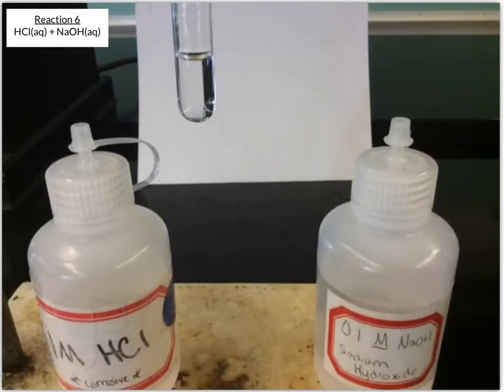But again, we had that happen with another one. And I said you should look at the compounds and you can predict if a chemical reaction would actually happen by predicting what could be formed. And then based on what could be formed, you determine, did something really happen? And is it that something happened and it's not observable to us?